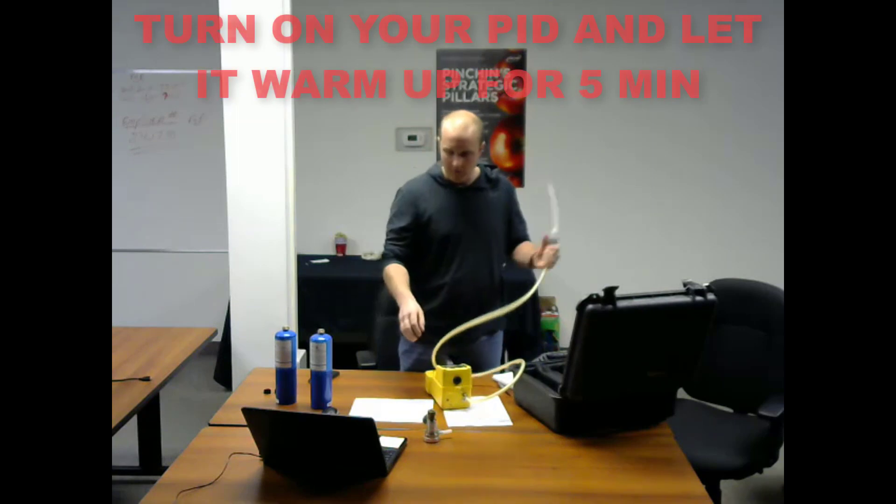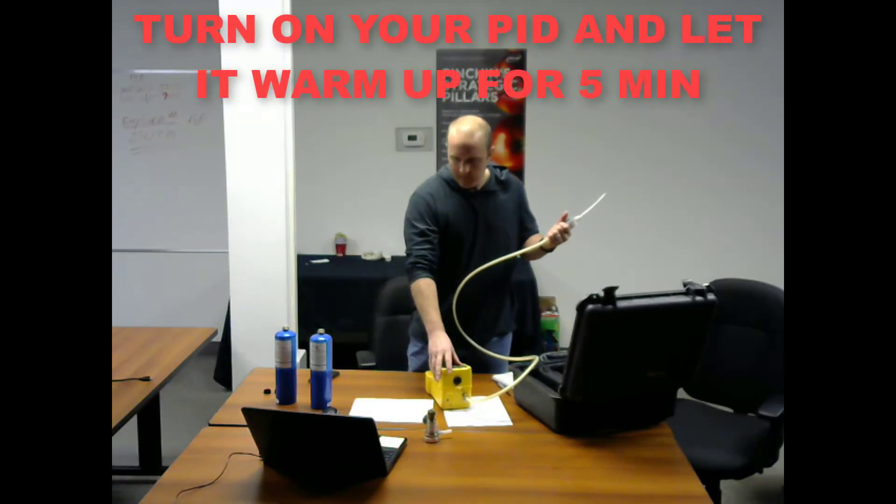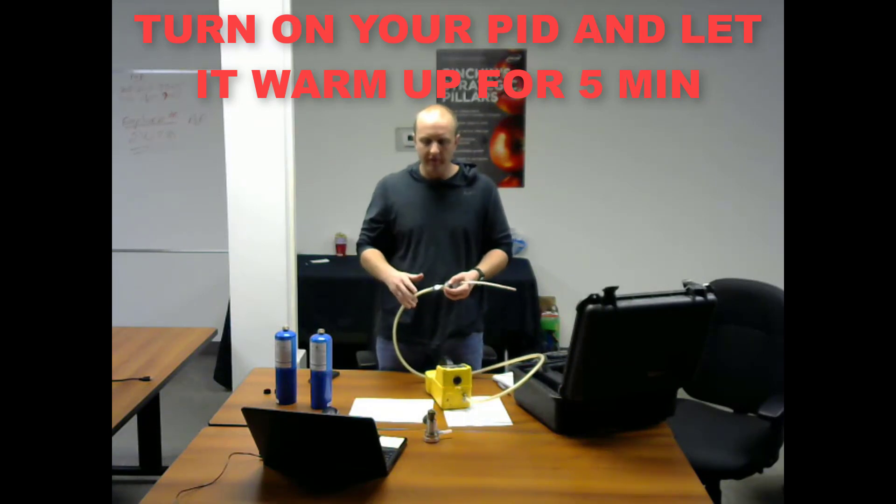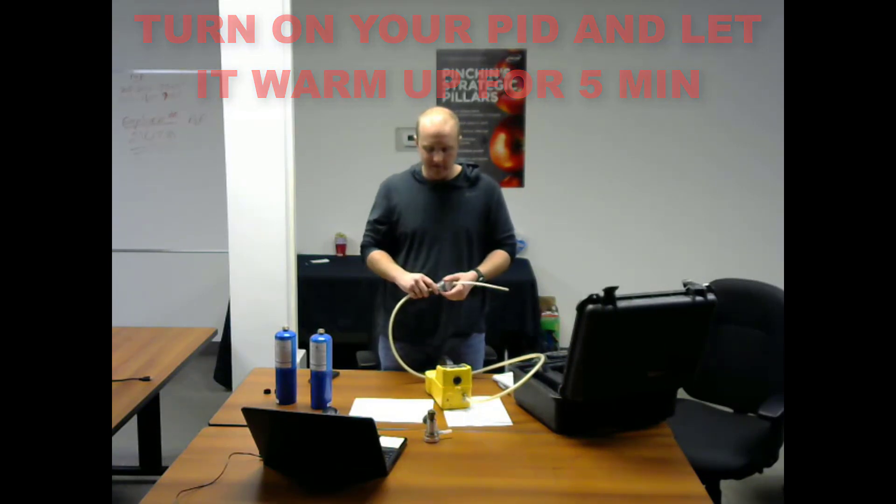Turn on your Eagle and let it warm up for about five minutes. You always need to let the sensors inside your PID warm up to ensure that they're working in accordance with the manufacturer's design.